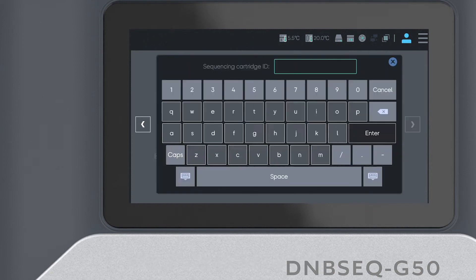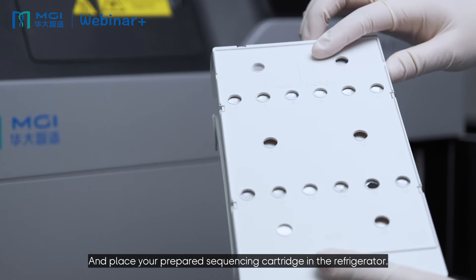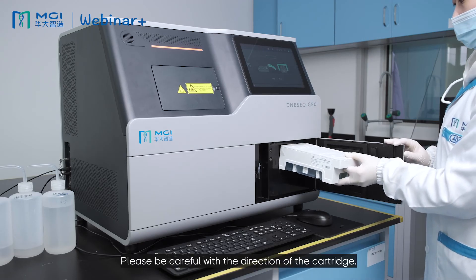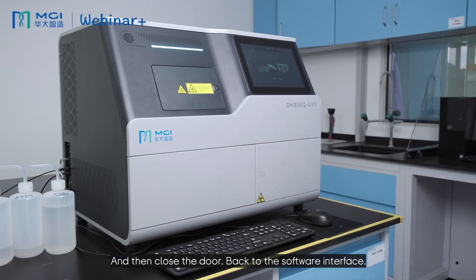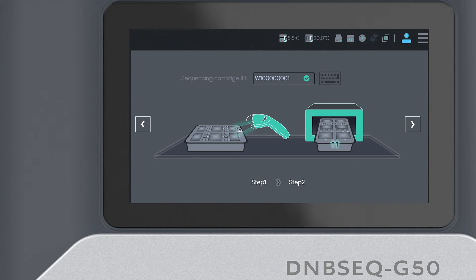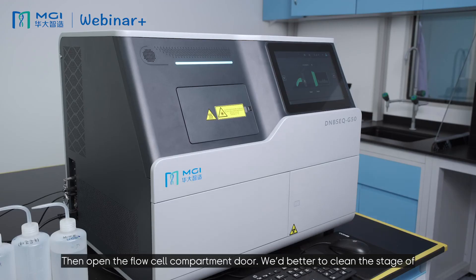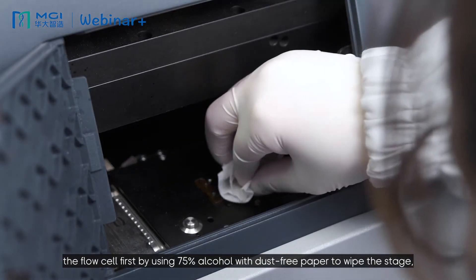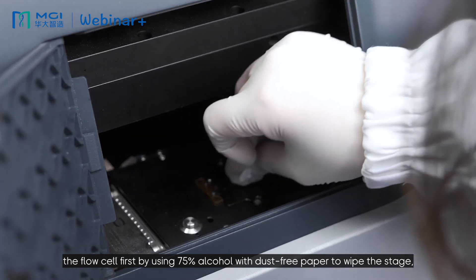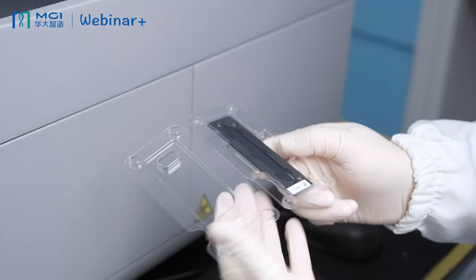Click Next. Now we need to type in your sequencing cartridge ID and place your prepared sequencing cartridge into the refrigerator compartment. Please be careful with the direction of the cartridge — simply slide it into the compartment and close the door. Back on the software interface, click Next. Now we need to type in your flow cell code, which can be entered manually or with a scanner. Then open the flow cell compartment door. It's best to clean the flow cell stage first using 75% alcohol with dust-free paper, then use a dust remover to remove any remaining dust.